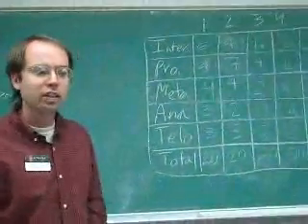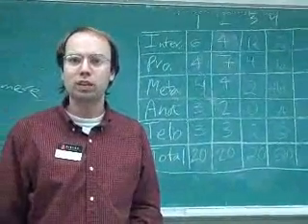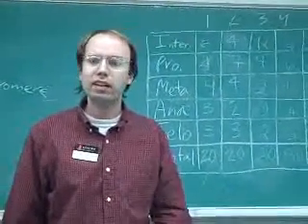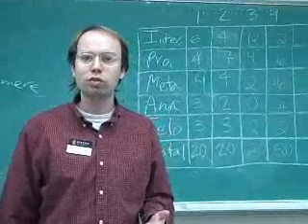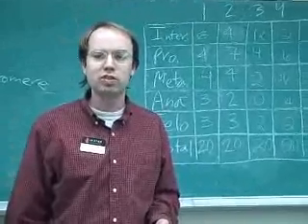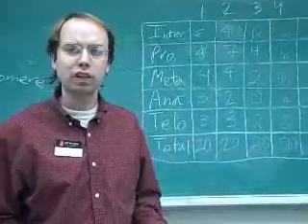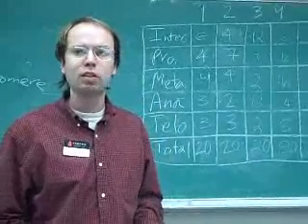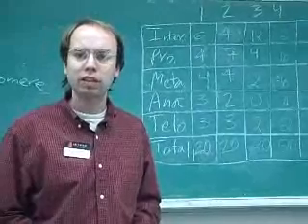Our next activity was an attempt to estimate how long each phase of mitosis lasts. Basically, the idea is that on our slide, our cells have been killed, and so they're all frozen doing what they were doing at the moment they were killed. If a particular stage lasts a long time, at any given time, there's going to be more cells doing it. If the stage is very short, at any given time, there's only going to be a few cells doing it. So we looked at 20 cells on the allium.